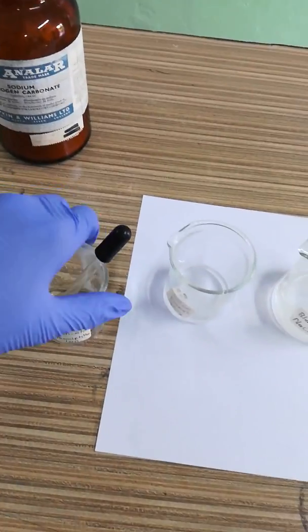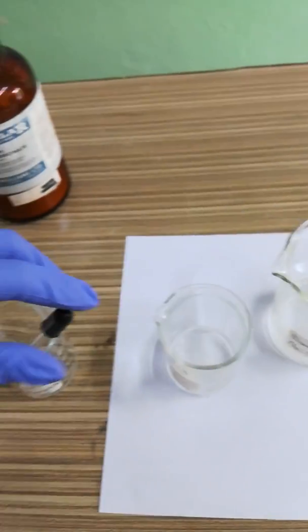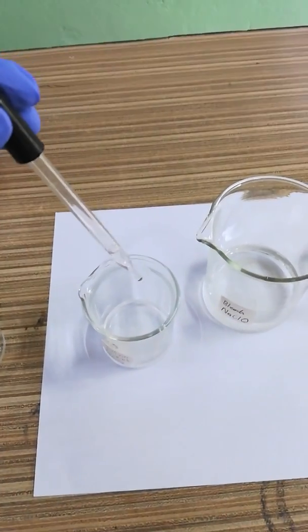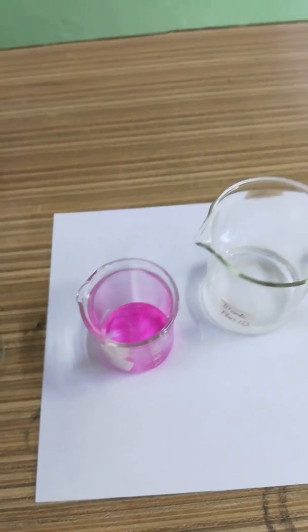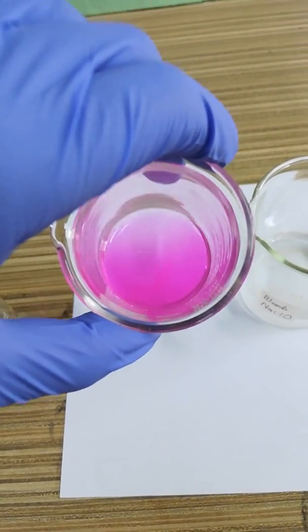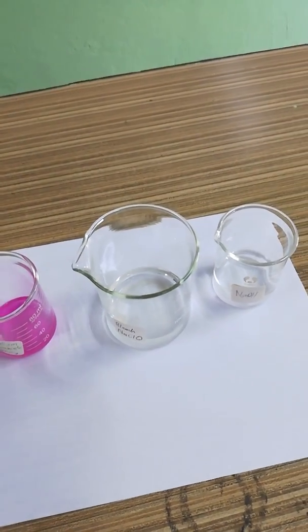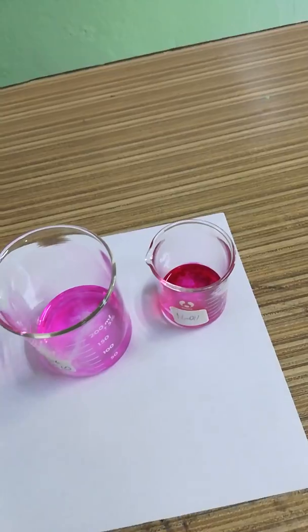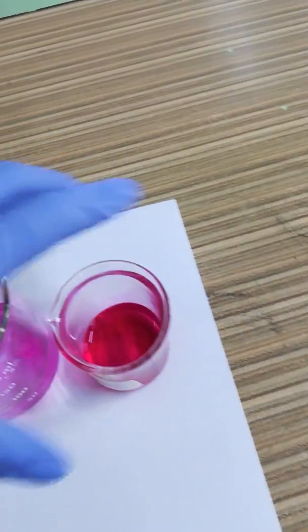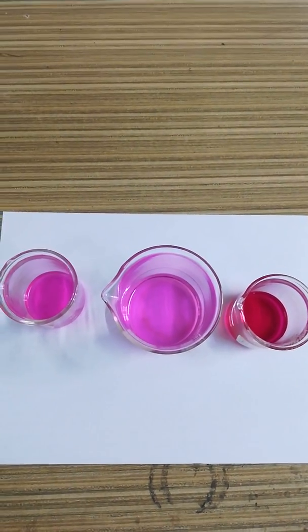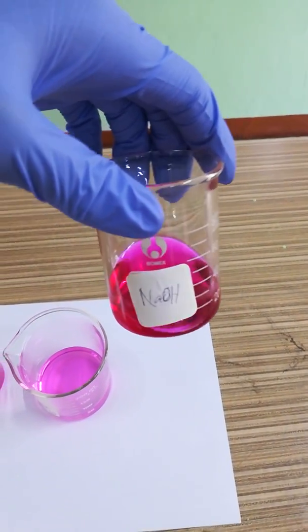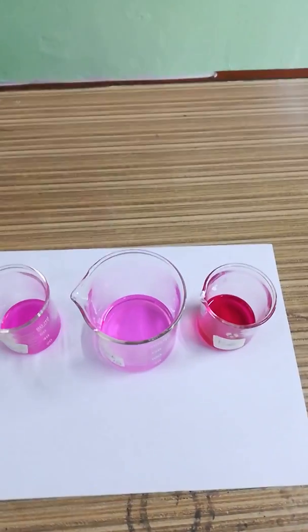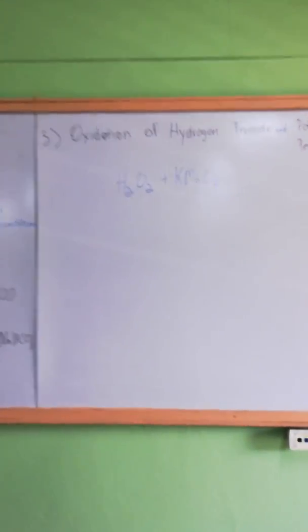We have this indicator. First we'll test it with sodium bicarbonate. Just one drop should do. Yep, that's the color change we wanted, and it should be the same for the bleach and the sodium hydroxide. Yep, it's very pretty. The sodium hydroxide as you might see is a bit darker than the others because it's one of the most commonly used bases in the chemistry lab.